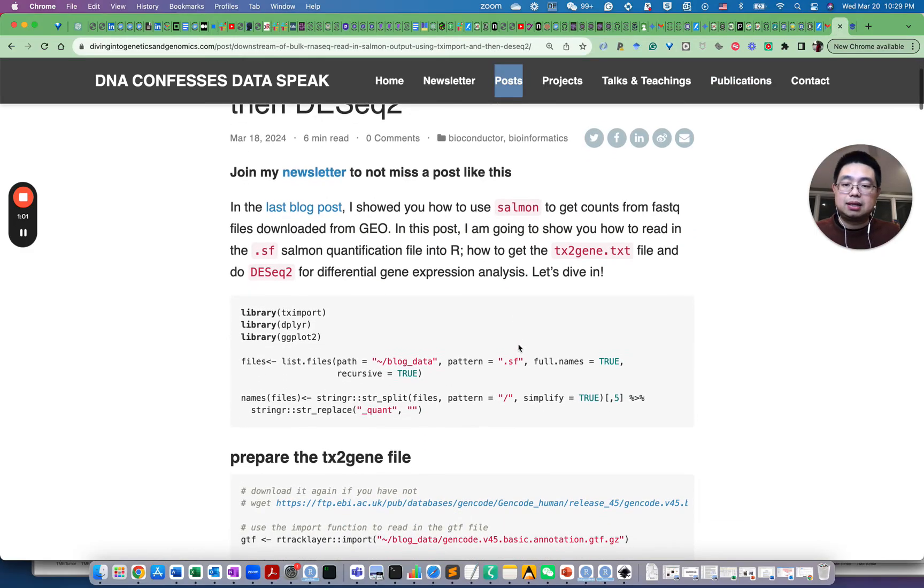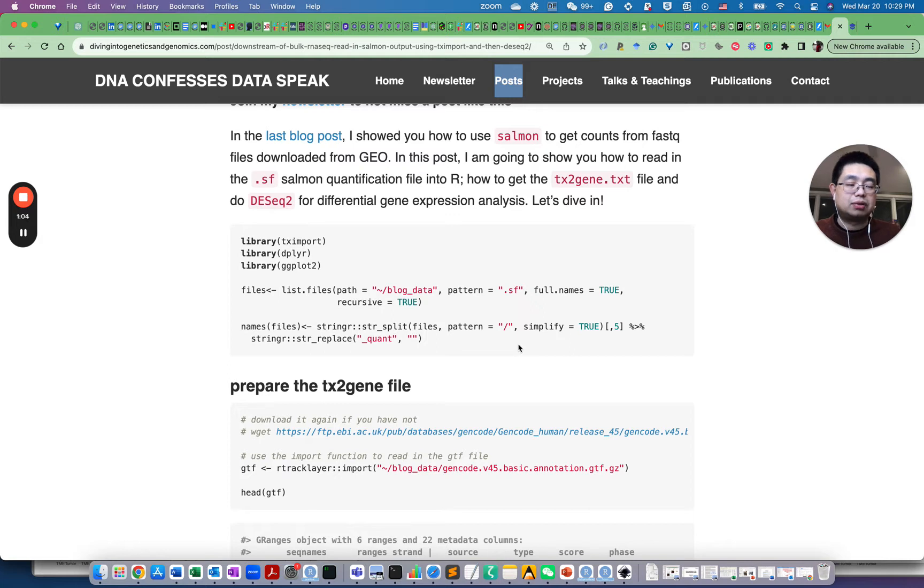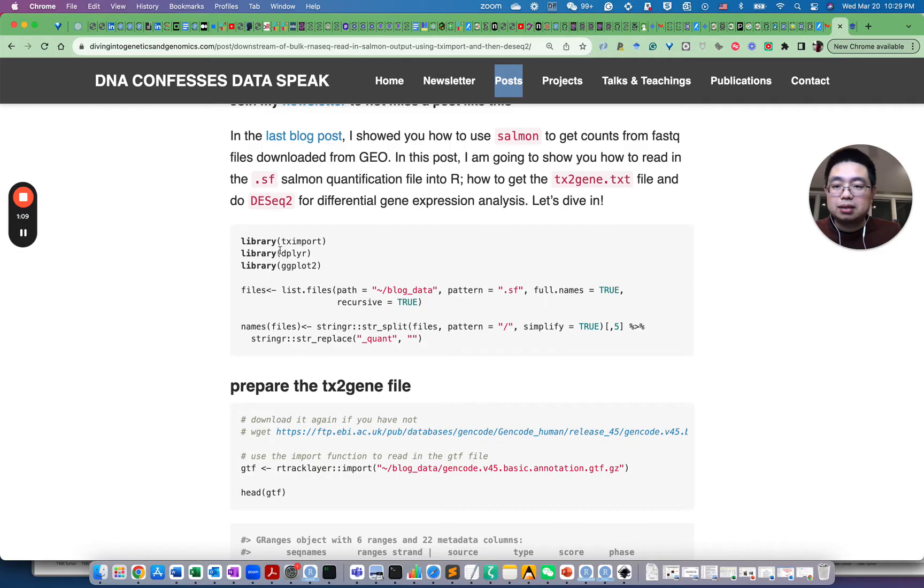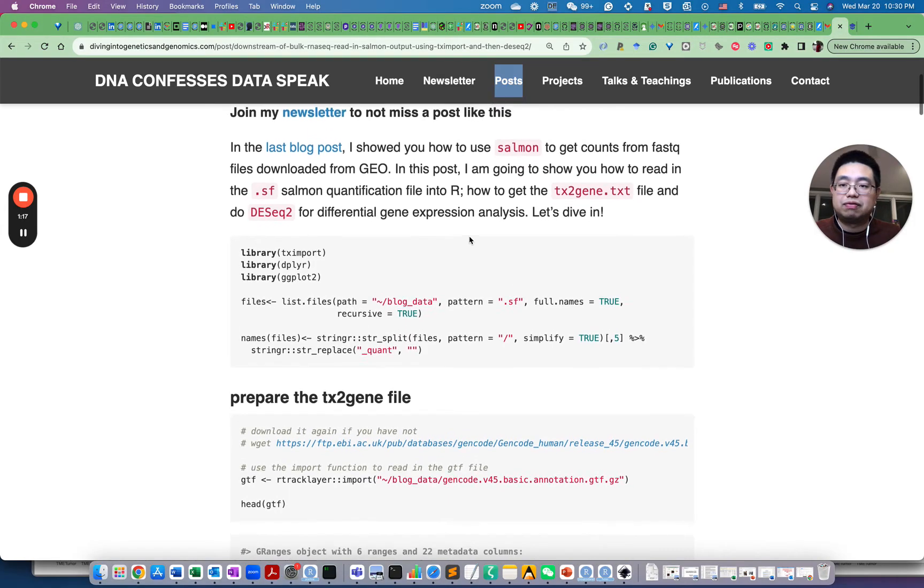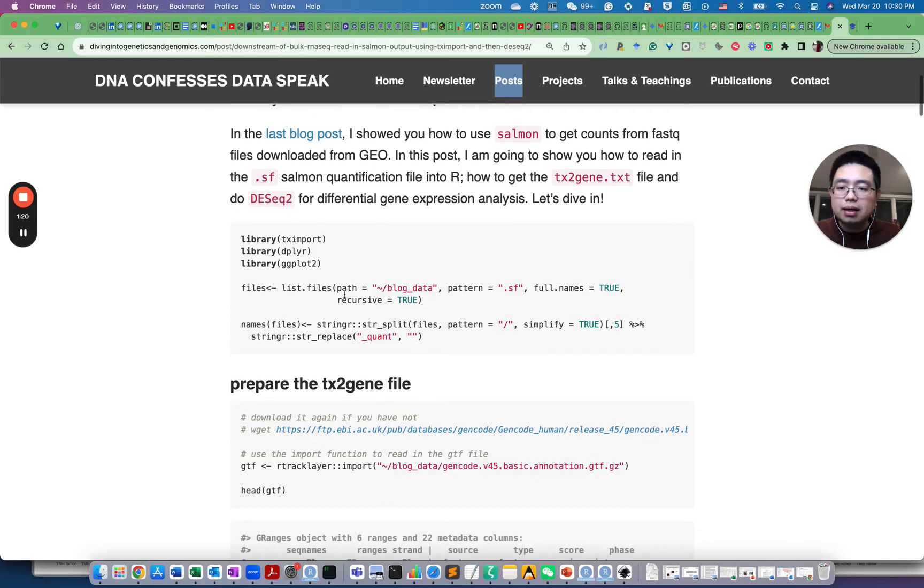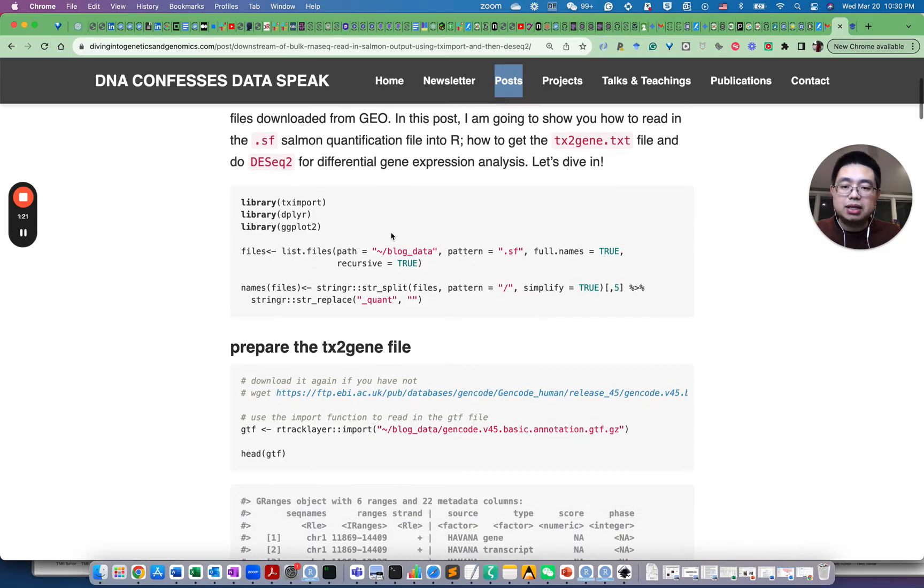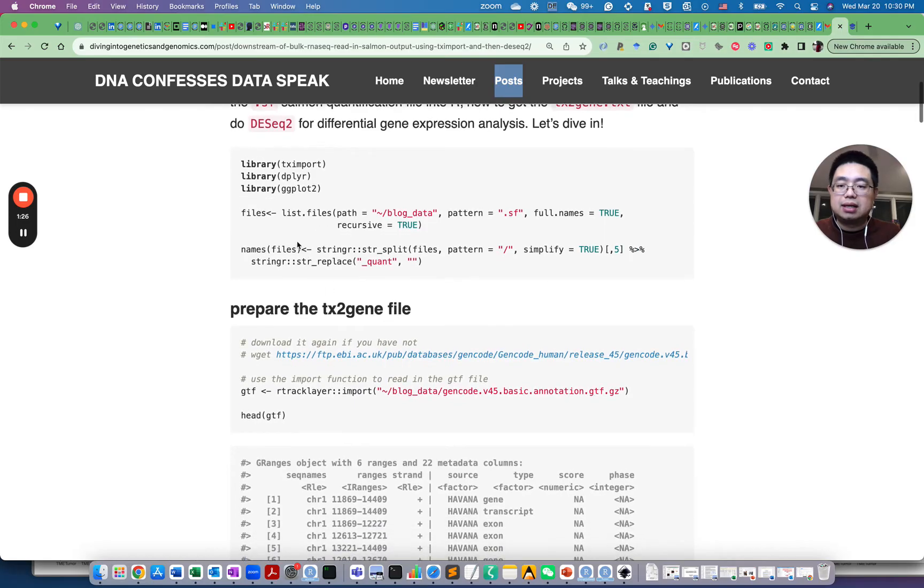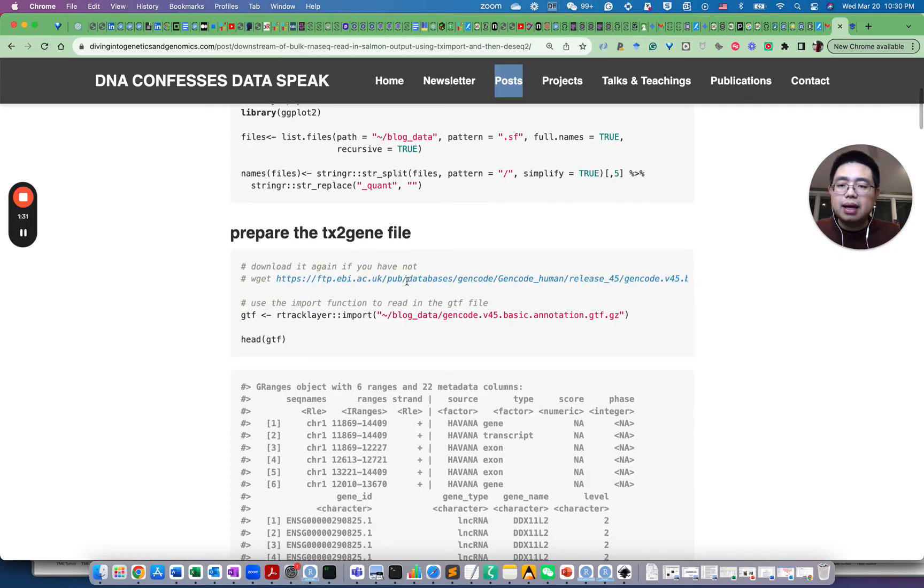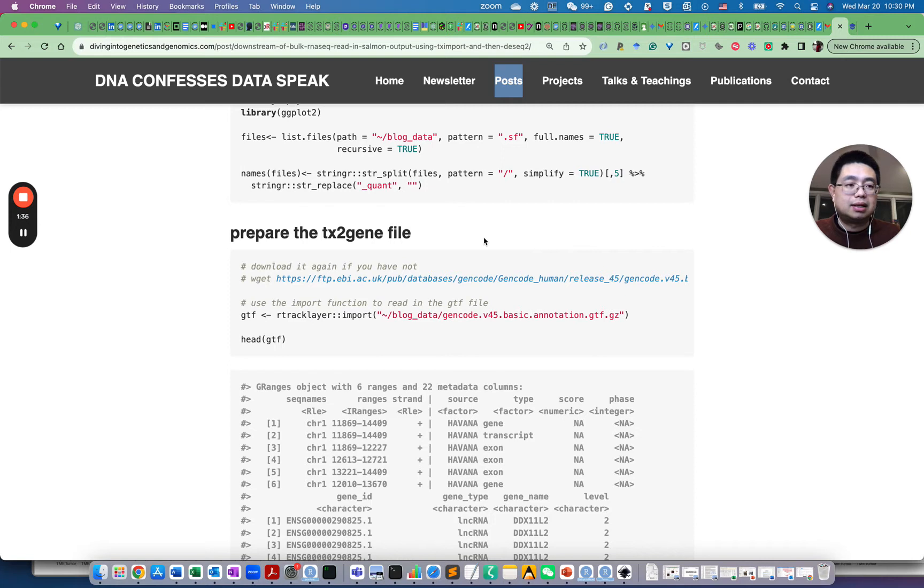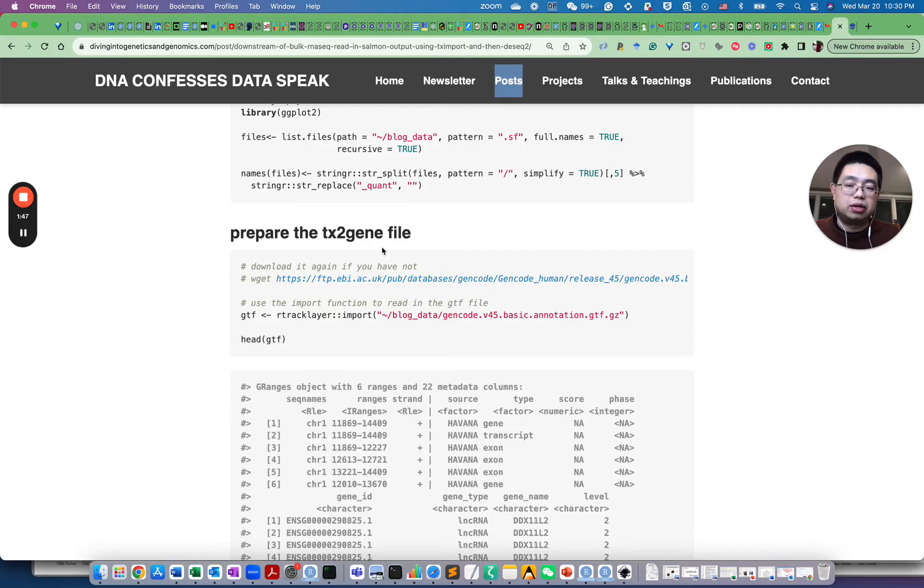Let's read in those quantification files. Those quantification files contain counts at a transcript level. You use this package called TX import from Bioconductor to read in those quantification files. Essentially, you encode here so you find those files and also you name those files with the sample name here. To read in the count file, to summarize the count file at gene level from the transcript level, you need to prepare a file called TX to gene or transcript to gene file.